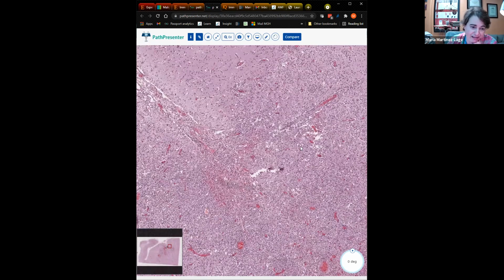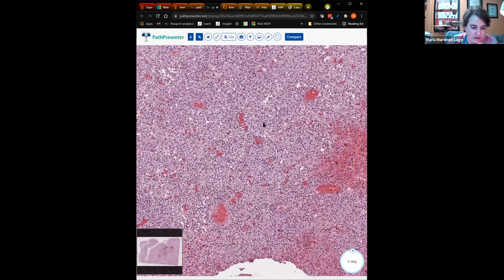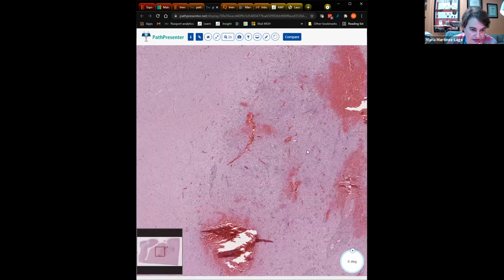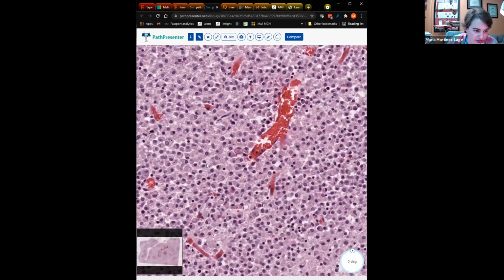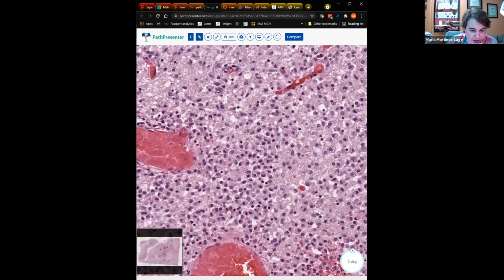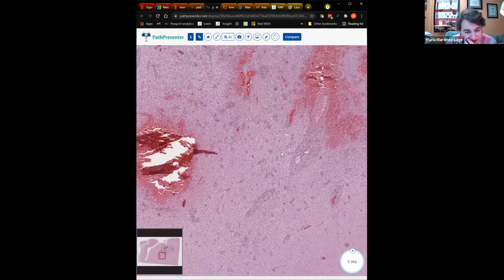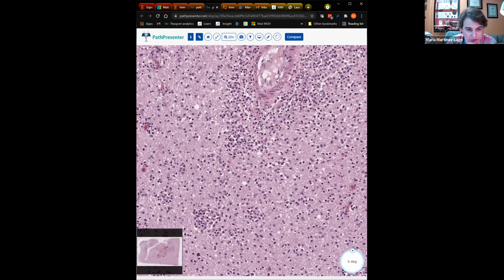Occasionally you might have a biopsy of something if they haven't realized that the person is immunocompromised. So what do we expect to see? Toxoplasmosis are necrotizing lesions. So frequently you will have areas of tissue loss with neutrophils and macrophages. Here, for example, is an area where you can see quite a bit of macrophages in this background brain. And here you start seeing breakdown of the tissue. It's interesting that there's not a lot of neutrophils in here, even though they're not infrequently found in toxoplasmosis.